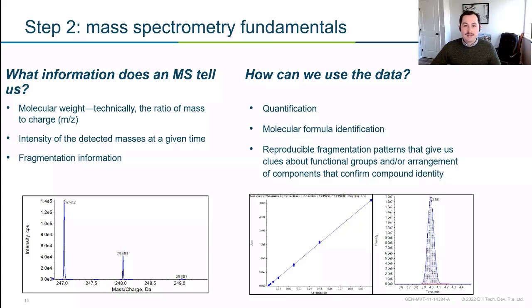So how do we use this data and what kind of questions can we answer with this data? Because that's the whole reason we're doing it, right? We have a specific question and we want an answer to that question. And that question might just be how much. So we might want to use this data for quantification, which is one of the more common uses for mass spec or MS data. But we can also ask some more qualitative questions like what is this compound, and do some confirmation scans that we'll talk about to be confident, yes, this is truly the compound that I'm interested in.